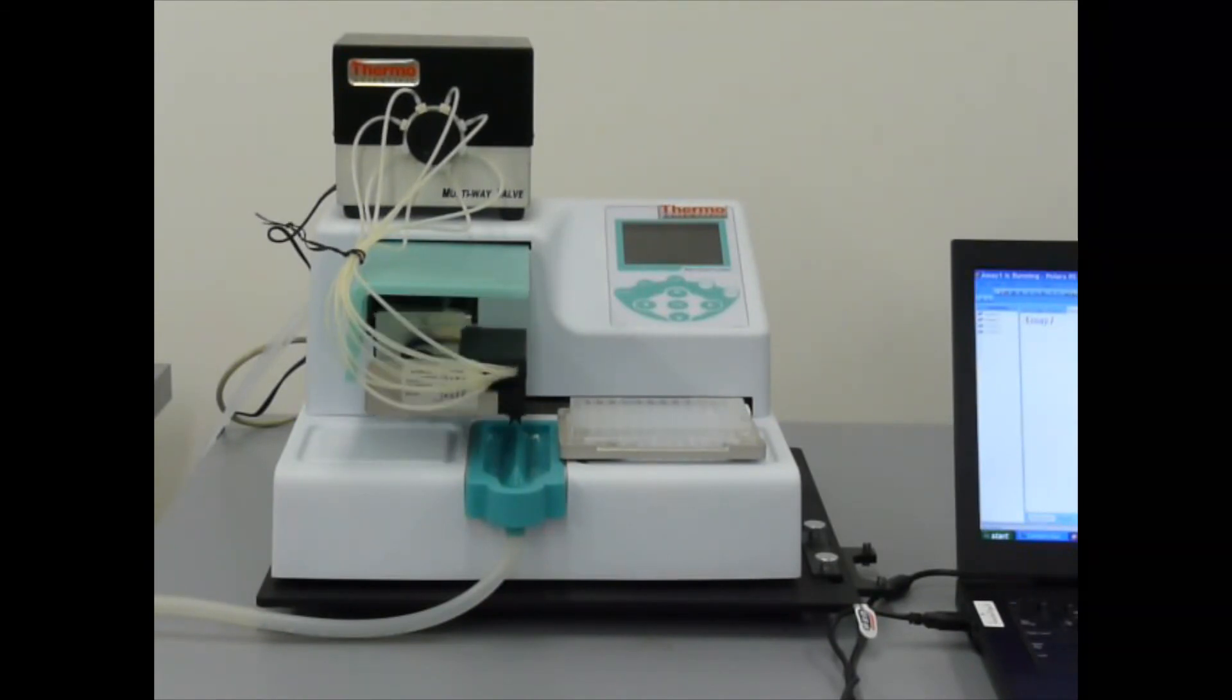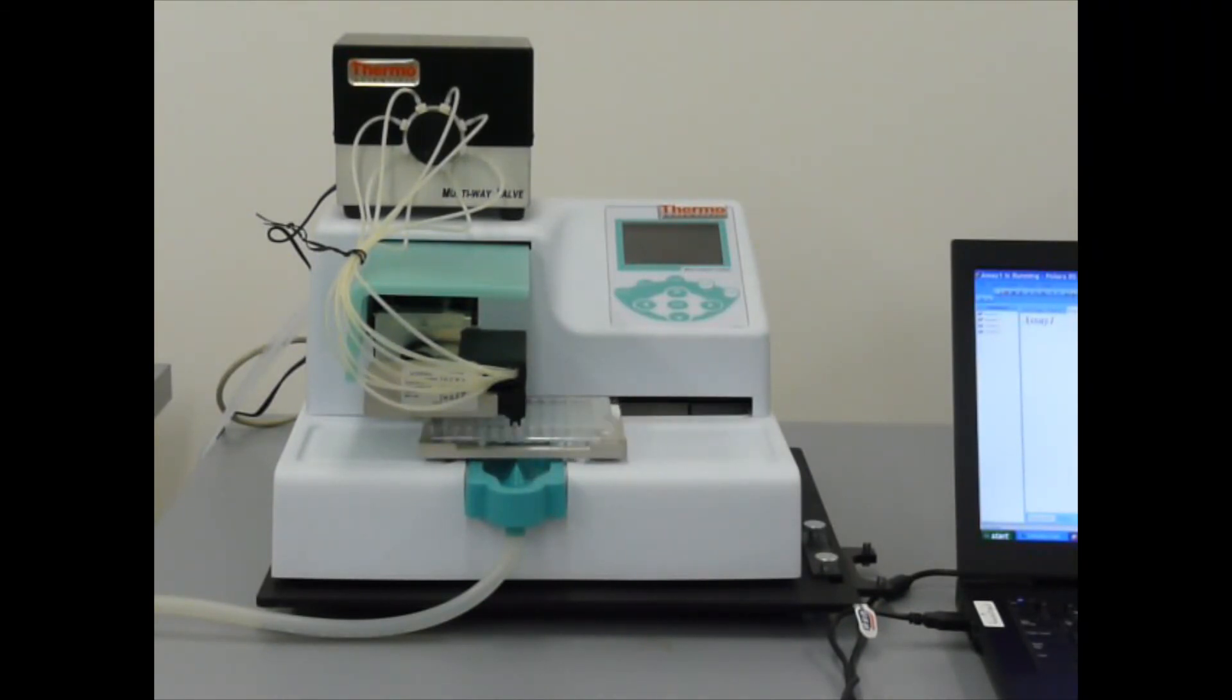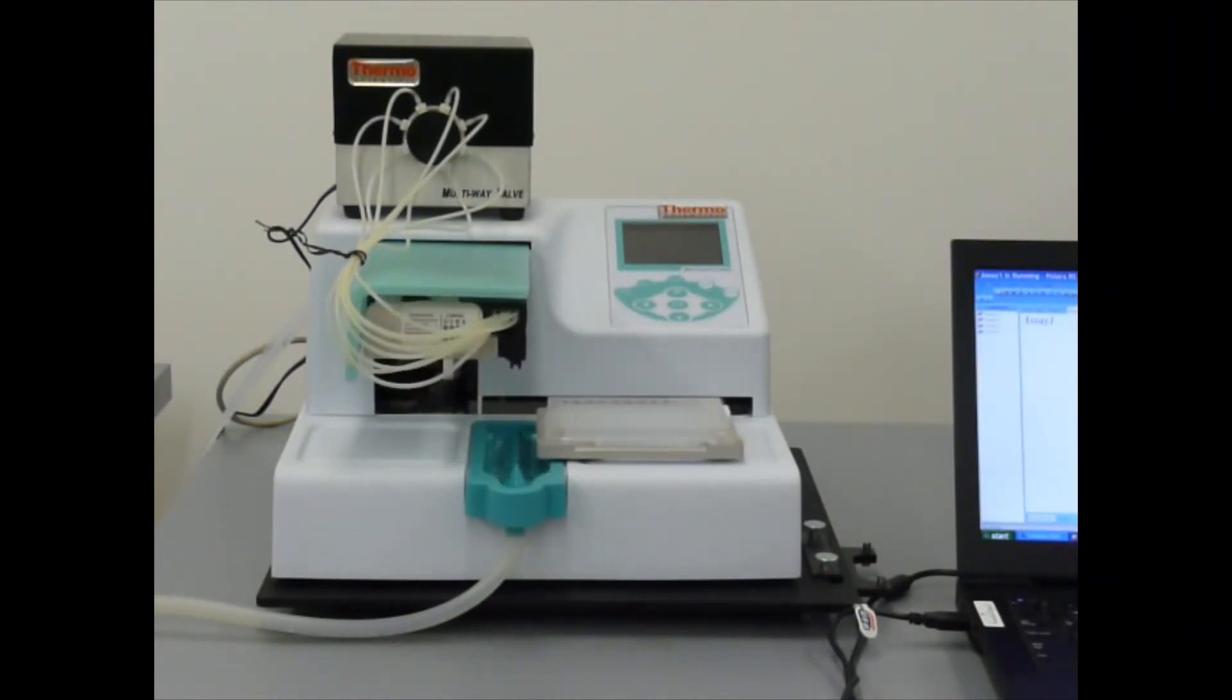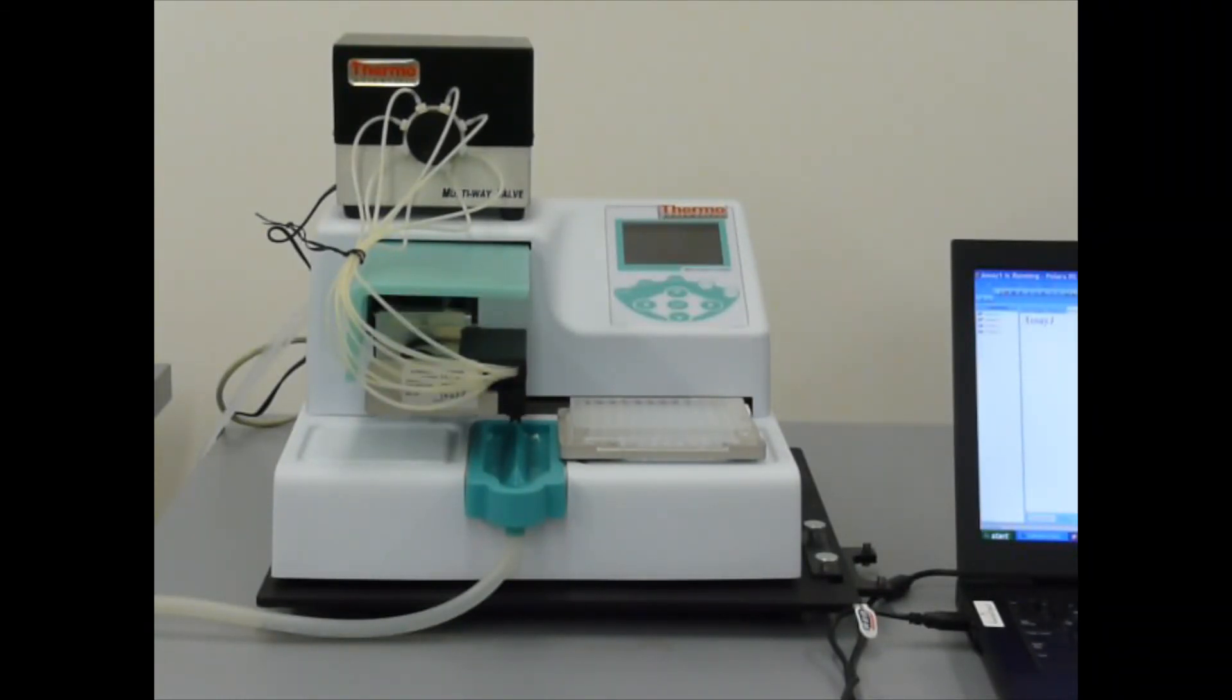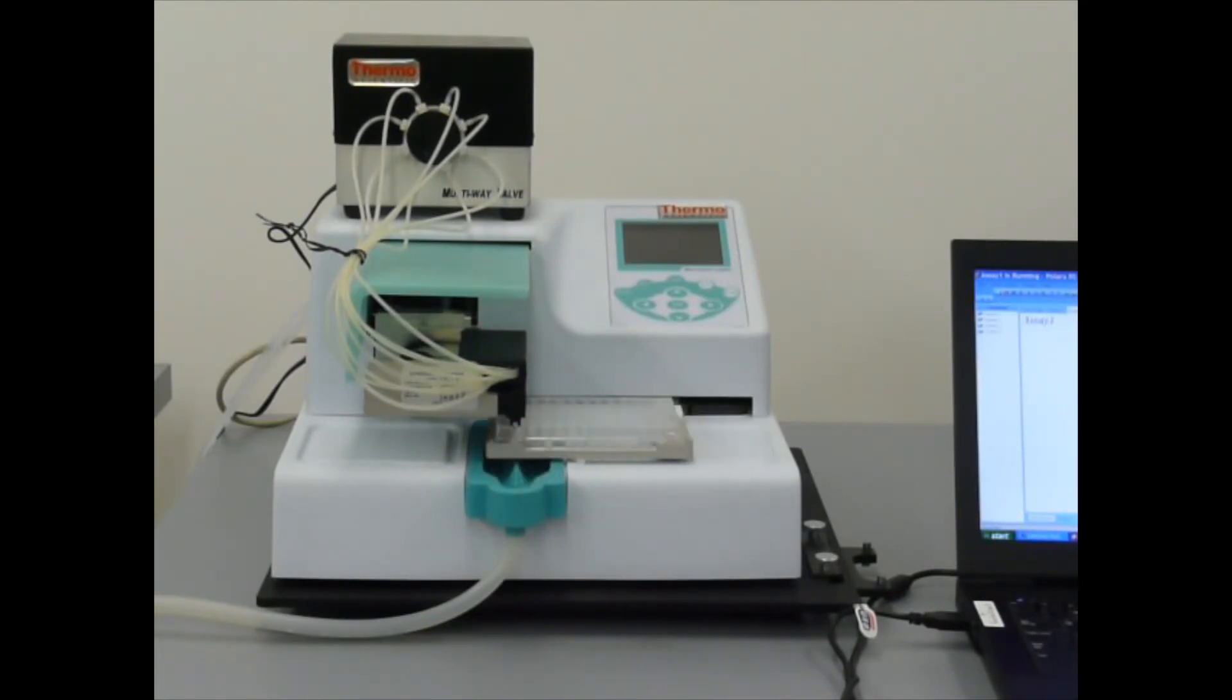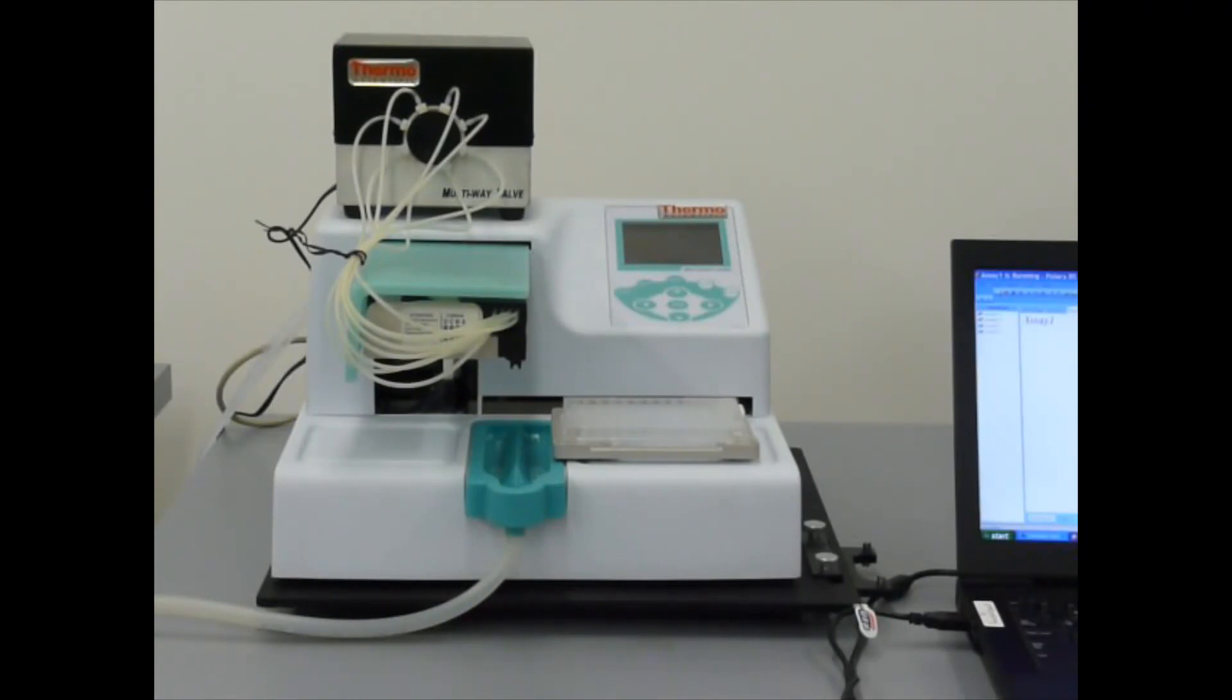There we go. It's running the process once again. Priming with reagent one, dispensing, priming with water, priming with reagent two, and now dispensing reagent two. And it's done. That's our entire process.